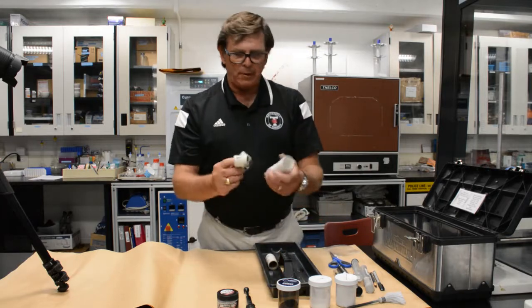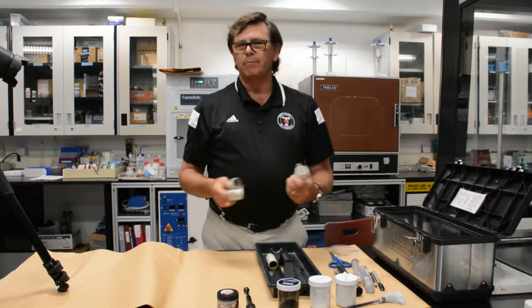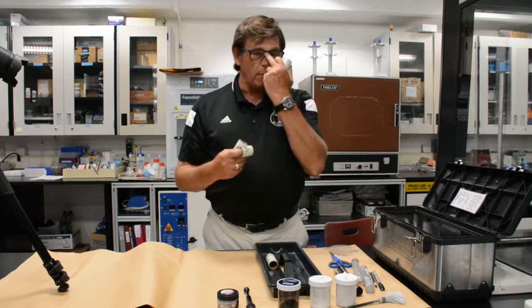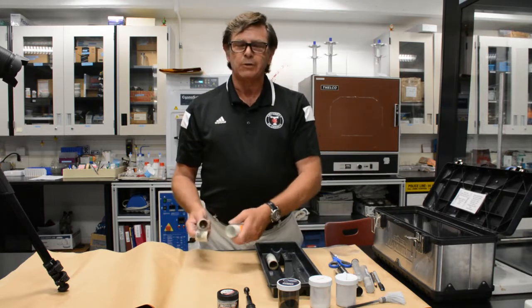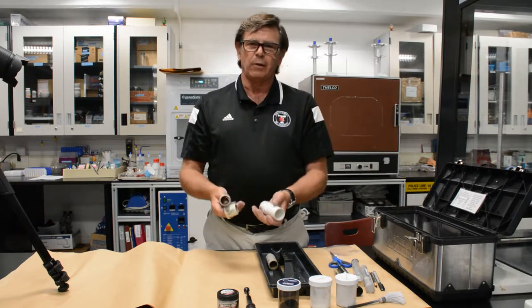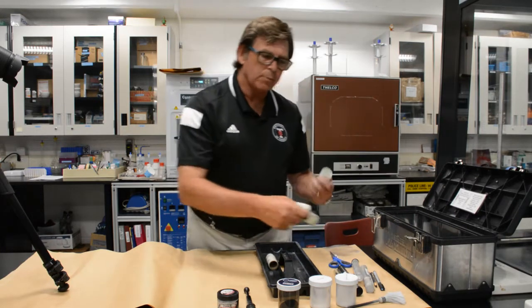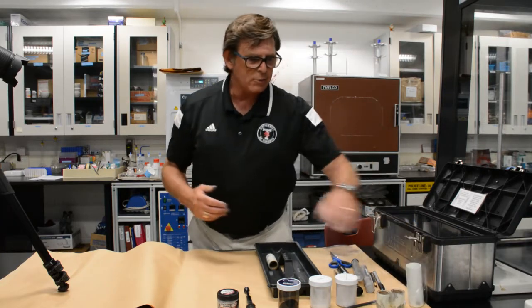So the fingerprint lifting tape is designed for lifting fingerprints after they have been developed on the surface, and in order to retain or collect those fingerprints, the tape is used. The tape is applied to the developed impression and lifted from the surface, and the impression will lift with it, adhered to the adhesive side or the underside of the tape, and then it gets applied to a backing card. And again, we'll expand on that as we go through.